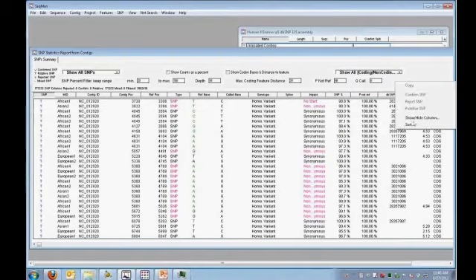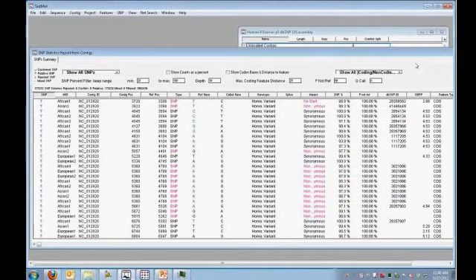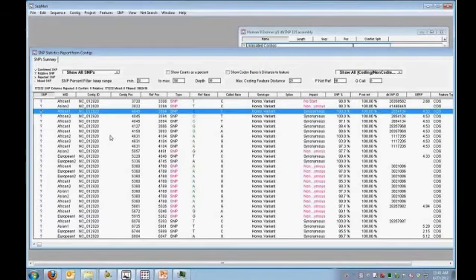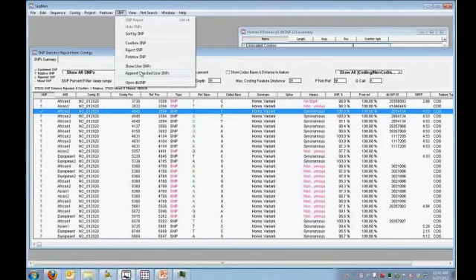If I right-click at the header, I can show or hide a number of different columns. Again, depending on my data source, I may make some disappear. And now I'll just kind of describe what the columns are. The first column is whether or not the SNP has been verified. Have I looked at it, verified that it is in fact a SNP? If I check on it, make a check mark, that actually verifies a SNP at that location. And when I do verify a SNP, I can also update my SNP database. So there's some interface here where I can append the checked user SNPs.